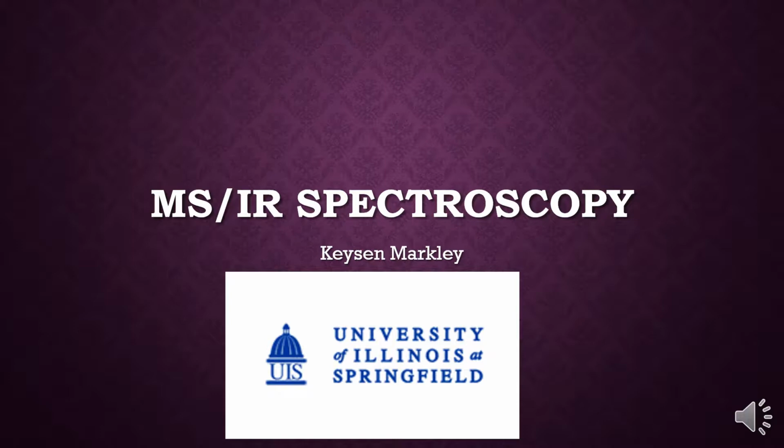I'm with the University of Illinois at Springfield, and today we're going to be learning how to use mass spectroscopy and infrared spectroscopy to analyze a structure. Now, we have the structure ready, so we're going to go ahead and start with mass spectroscopy.